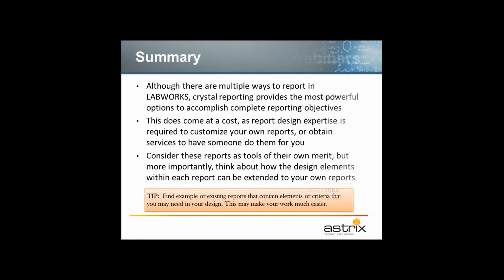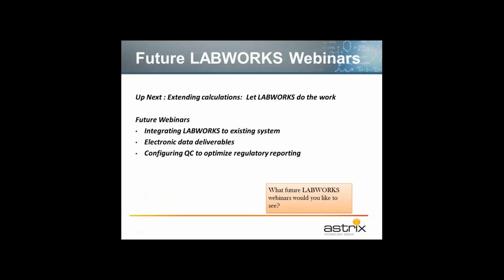So with that said, I do want to talk a little bit about our future LabWorks webinars. We do plan on continuing these. Up next, we're going to do one on calculations, how to extend those calculations to let LabWorks do the work. We also have some ideas of maybe integrating LabWorks to your existing system, some on electronic data deliverables, and maybe some on configuring QC to optimize that regulatory reporting.